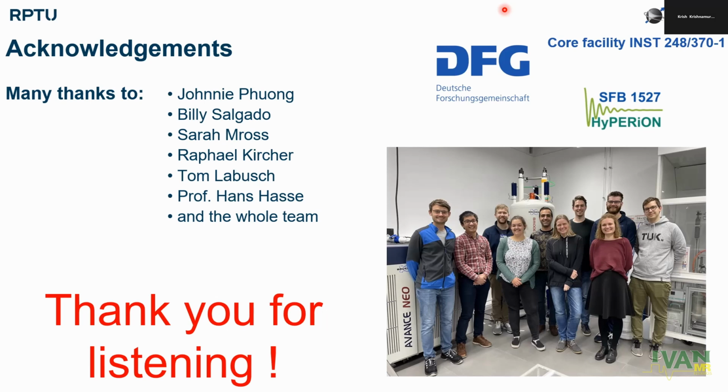And so essentially now we have the opportunity to actually study kinetics at a per increment level, and that time point can further be reduced by your ODNP methodology to make it per increment, per scan, kinetic time points, and study really fast reactions. I am really, really excited by this potential opportunity that it might introduce for real fast reactions. Thank you. There's no question.